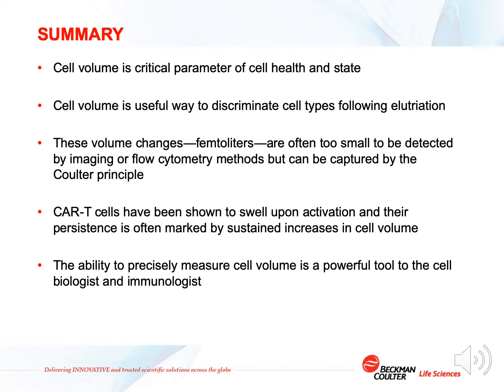CAR T cells have been shown to swell upon their activation, and their persistence in cancer killing is often marked by sustained increases in cell volume. The ability to precisely measure cell volume is therefore a powerful tool for cell biologists and immunologists who need to track the health and activation state of cells.